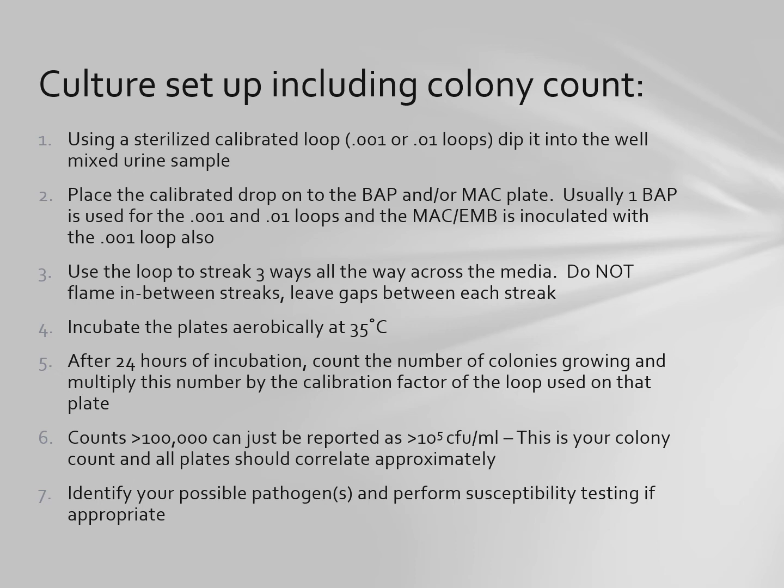We're going to incubate our plates aerobically at 35 degrees, and then after 24 hours of incubation, we can count the number of colonies growing and multiply this number by the calibration factor of the loop that we used to plate the organism. Counts of 100,000 for a clean catch can be reported as greater than 10 to the 5th colony forming units per mil. This is your colony count, and all plates should correlate approximately.